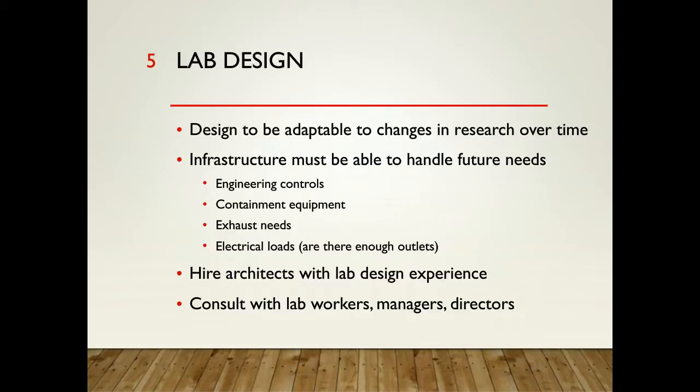So when you're looking at lab design, you want the design to be adaptable to changes in research over time. You want to try not to design the space for a specific type of research that would be expensive to redesign for a future occupant. So you want to make sure that the design is flexible into the future.